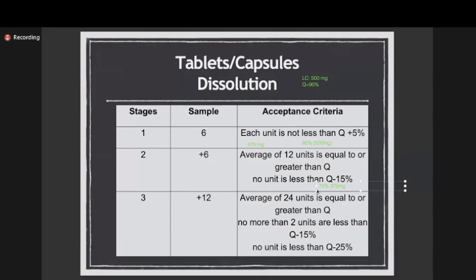If any is not satisfied, your product fails. That is for your dissolution test.